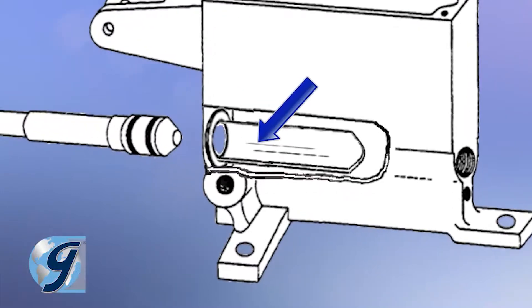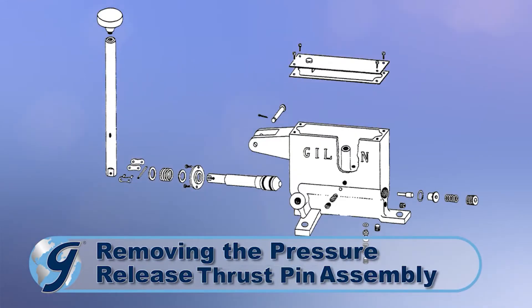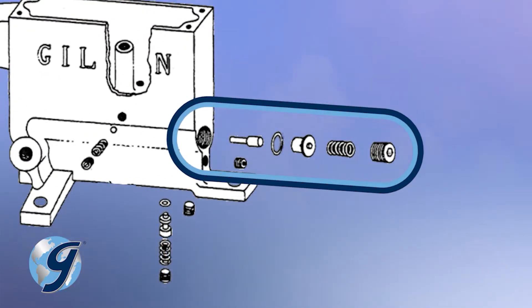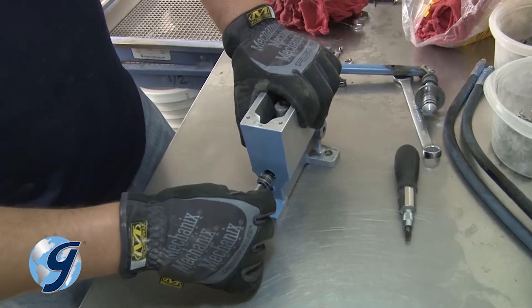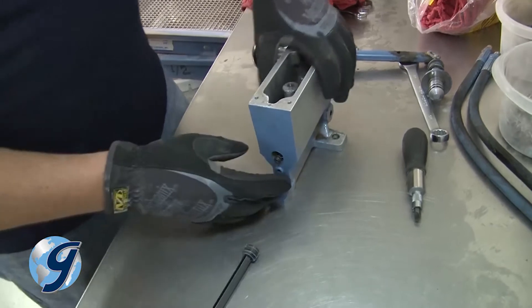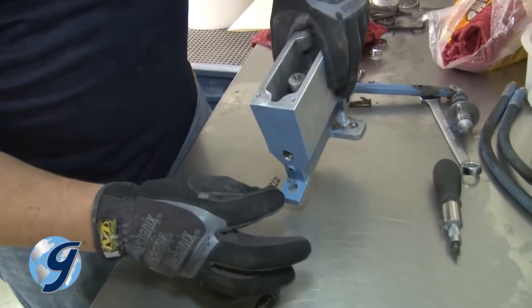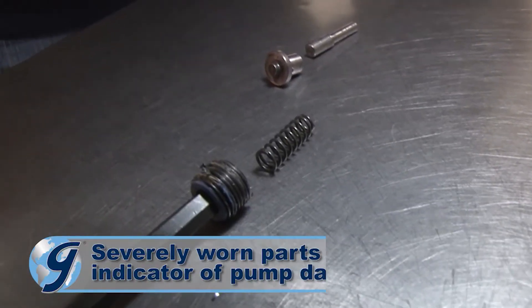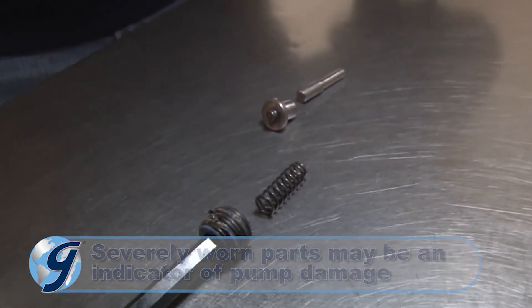If scoring is evident, the pump will have to be replaced. Now remove the pressure release plug, which is the largest plug on the pump. The pressure release spring and thrust pin with O-ring should come out easily when the pump is tilted. Inspect these items for wear and set them aside. Severely worn parts may signal further damage to the pump itself.